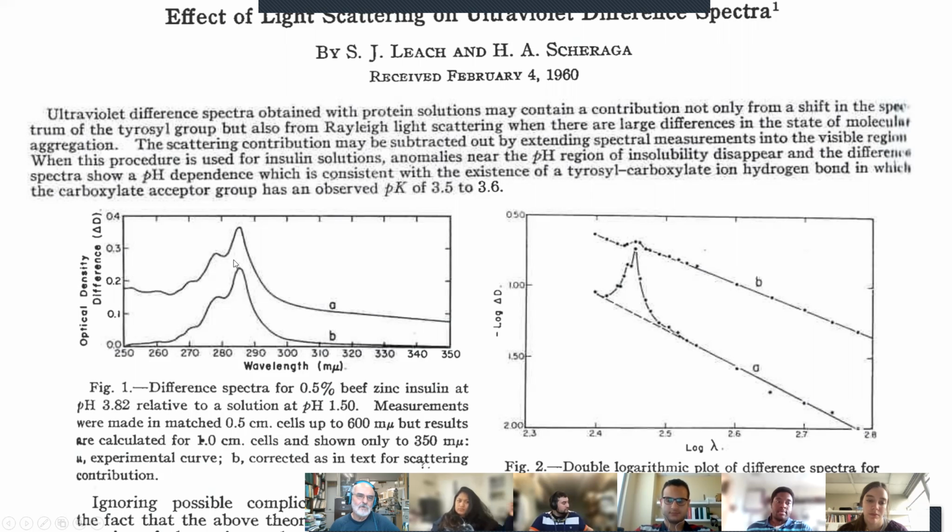So when you take a 280 and you get a spectra at 280, it doesn't necessarily correspond to the peak, and the environment might change the position of the peak. So that's something that you have to worry about. But there should basically be no absorbance in a protein sample above 310, 320. And in this particular set of samples, they have a fair amount of optical density difference.